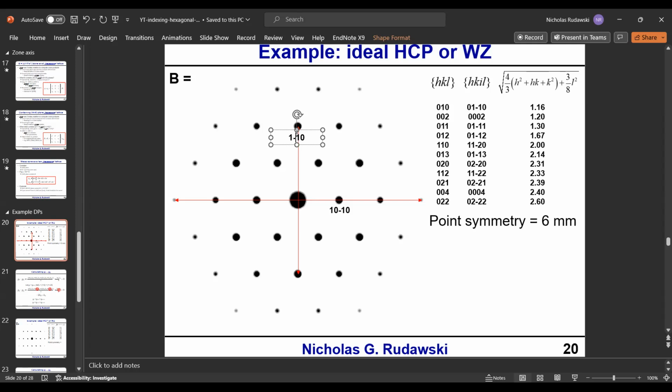Okay, this is 1, 2 bar, 1, 0. Let me get these hideous arrows out of the way for the moment. And that's quadruple 0. Okay, so now the zone axis. I have to cross G1 with G2 and I get the zone axis, right? Now remember, I have to do 3 index notation for this. So this would be 1, 0, 0 cross 1, 2 bar 0.